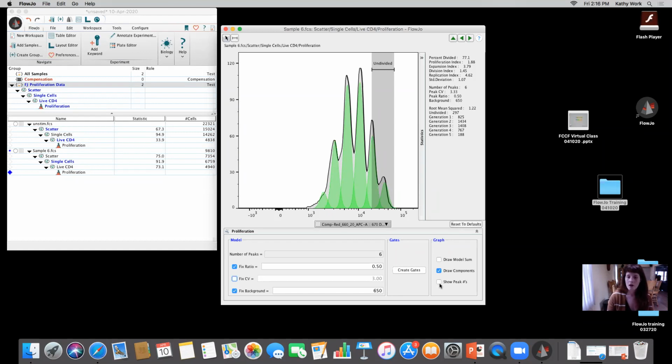Right. So if we have 100 cells that are all the same, they wouldn't take in exactly the same amount of dye, and that distribution or variation would be typically larger than you would find in a hard dyed bead.